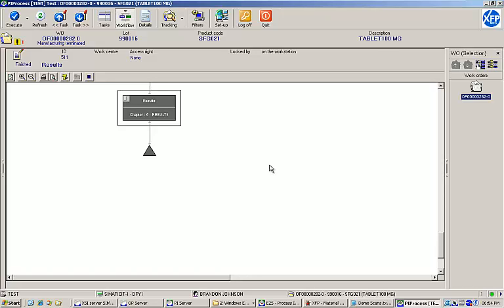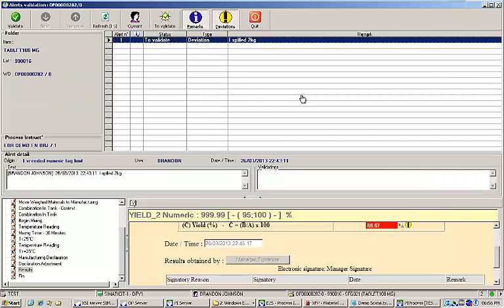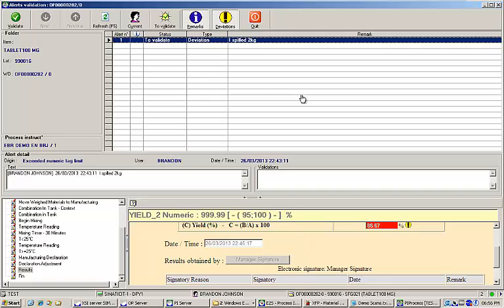Let's open the alerts tracking window. From here, it is possible to see all of the alerts and deviations that were generated during EBR execution. In the table at the top of the screen, you can see that deviation that was generated by missing the batch yield target.